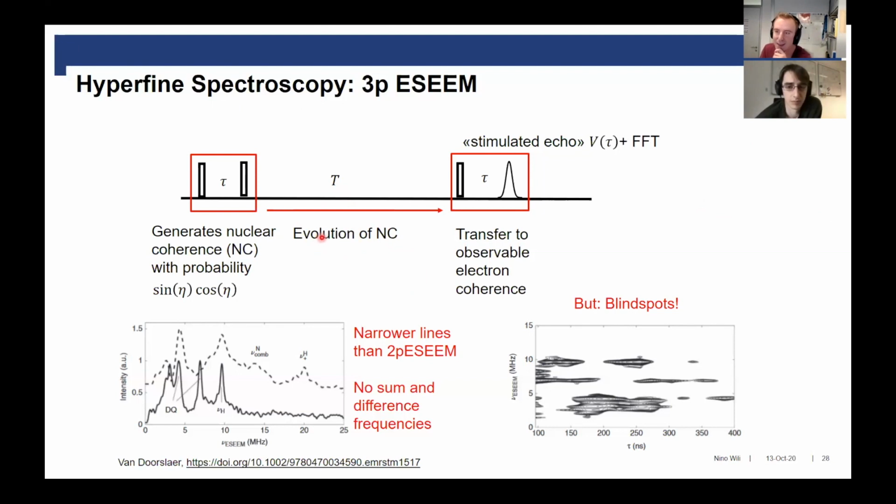So everything that you have in terms of coherence pathways are just of the electron spin. And if it's a 1-spin system, it's just -1, 0, or 1. The problem usually boils down to selecting the echo that you want. But of course, you have to design the phase cycling with the usual coherence transfer pathway scheme, and then you can figure out the best way to get only the echo that you want.